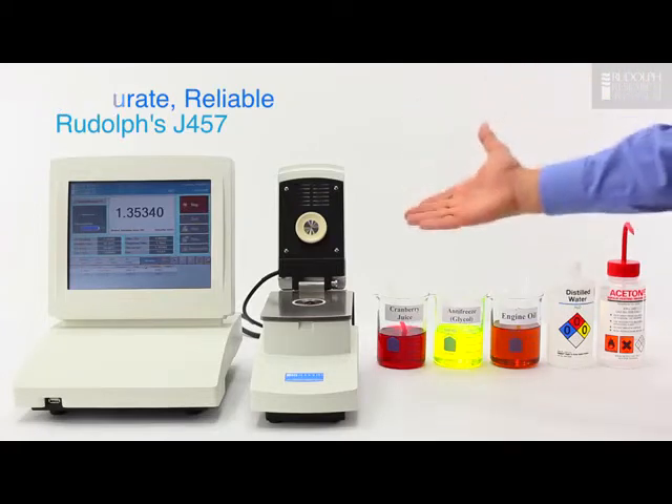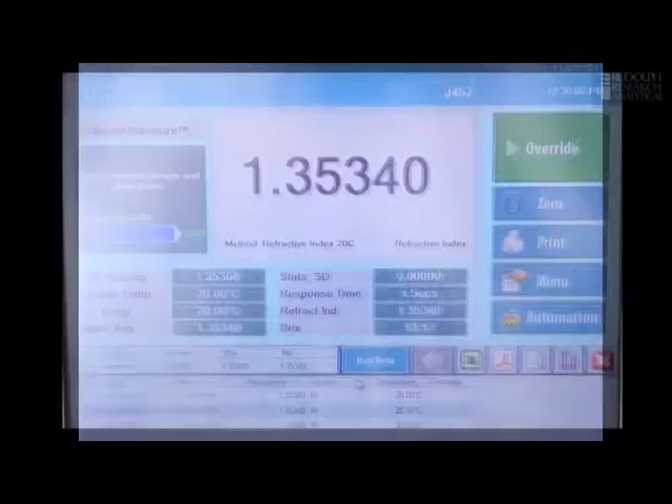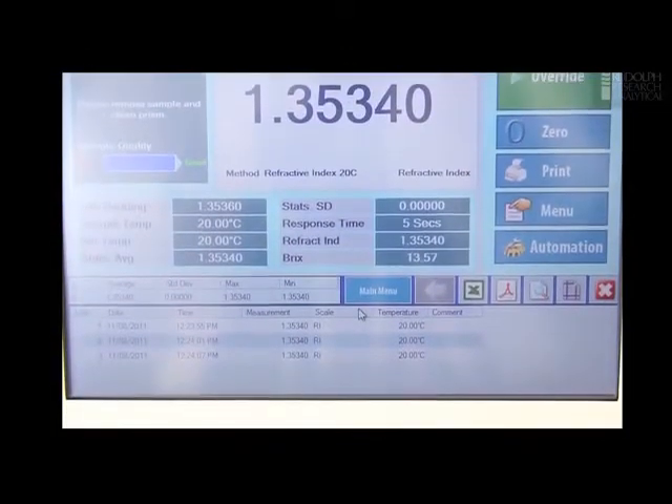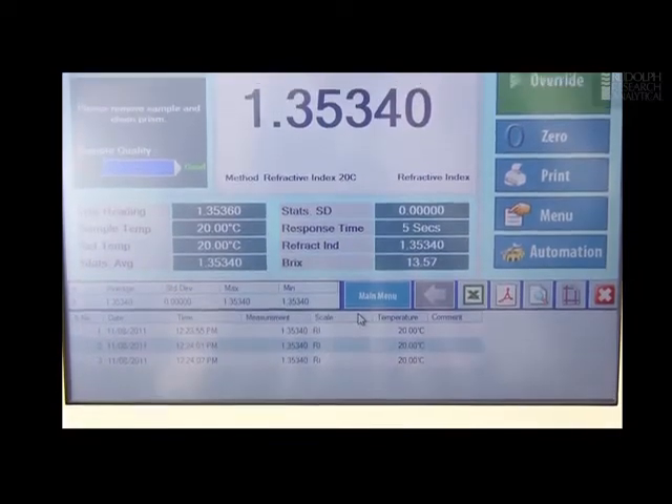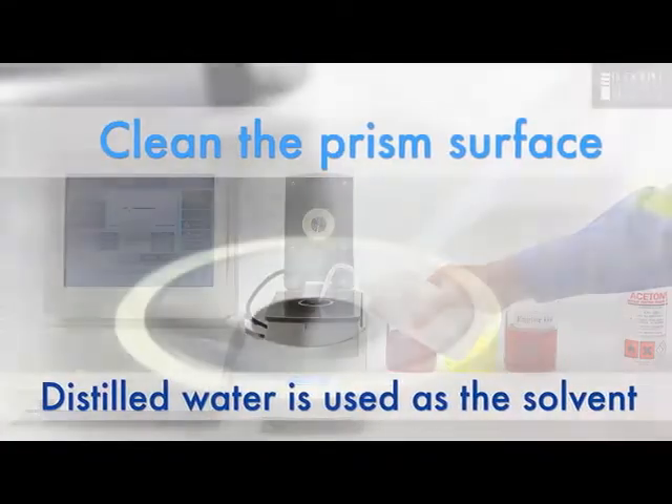We can actually check on the importance of whether the lid is open or closed by looking at our results. We can see that all three results were the same so we know that there's no significant evaporation going on. Clean off the cranberry juice and wipe any last traces off with distilled water.